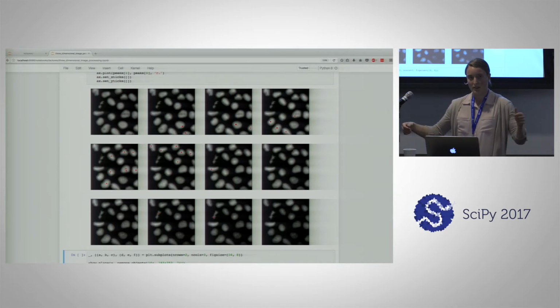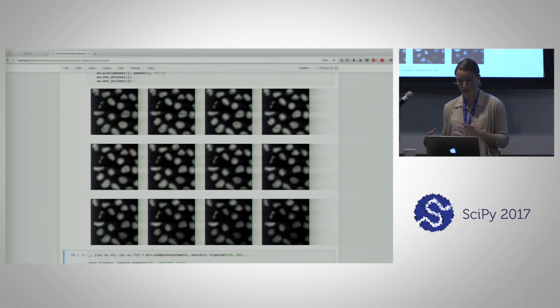So the points furthest from the edge are the brightest, and the points closest to the edges of the cells are the dimmest. We observe that the cells with one marker, the cells that were properly segmented, appear very uniform in their distance map, whereas the cells that were assigned multiple markers don't have that same level of uniformity.